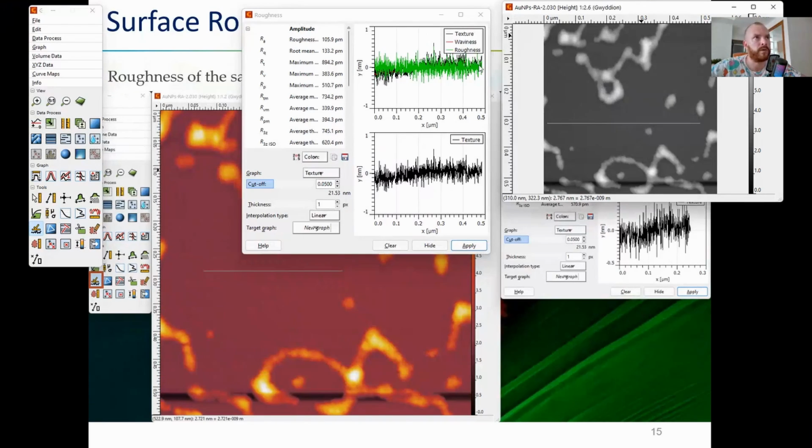They are all more or less the same. And texture we have here almost nothing. And also we have different roughness parameters. Here the roughness parameter is like, what, nothing, like 100 picometers. So we have a super flat surface, because it's mica, and mica is really flat.